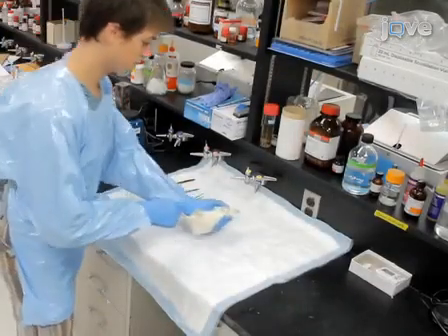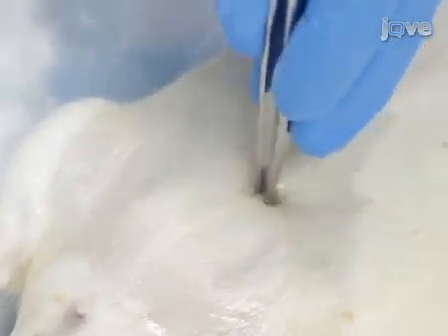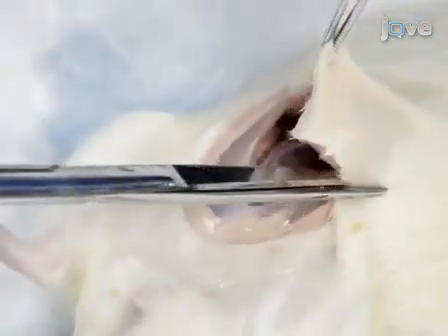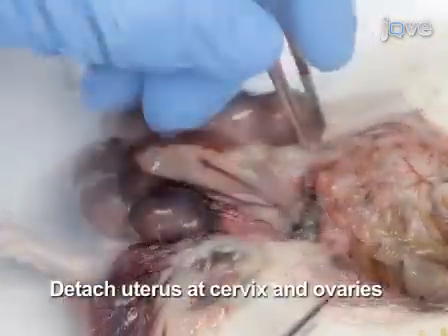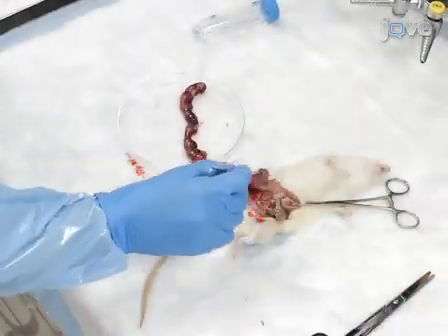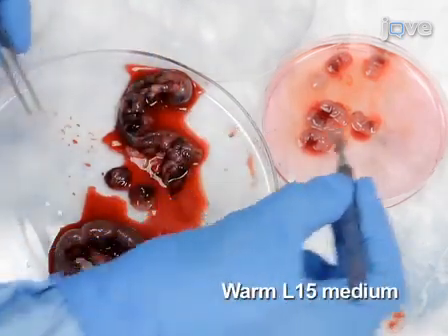To prepare the cultured cells that will be grown on electrospun fibers, obtain E15 embryos from a euthanized pregnant rat. Begin by sterilizing the area with 70% ethanol and then tenting the skin of the abdomen. Cut through the skin and muscle layers to expose the abdominal cavity. Locate the uterus and detach it at the cervix and ovaries. Transfer the uterus to a sterile dish. Then, remove the embryos from the uterus with scissors and place them immediately into warm L15.